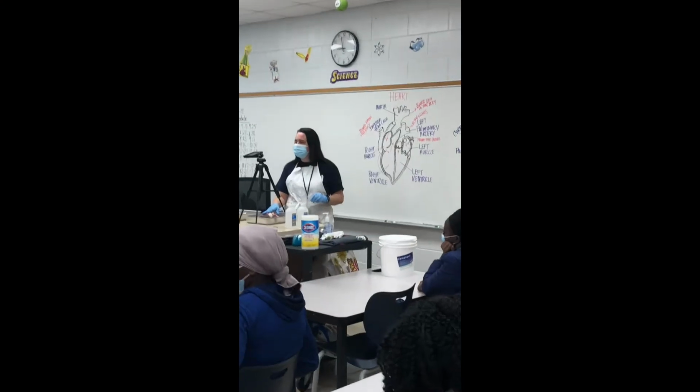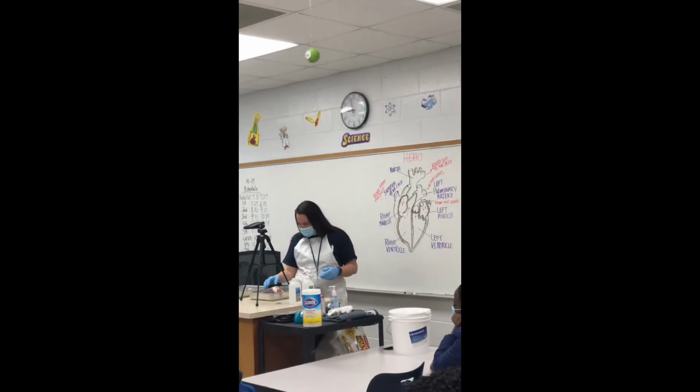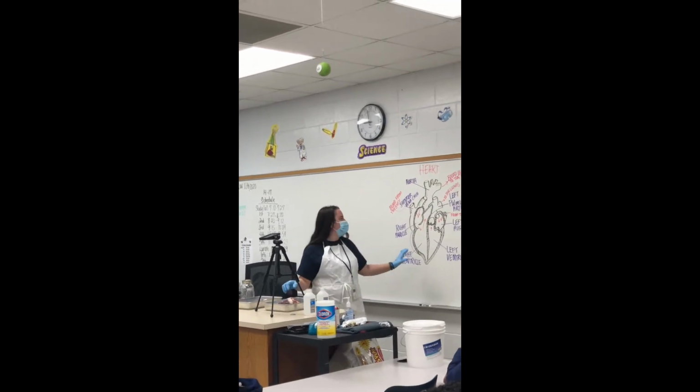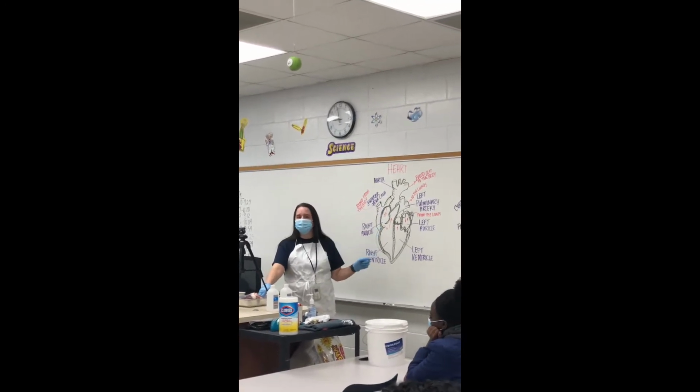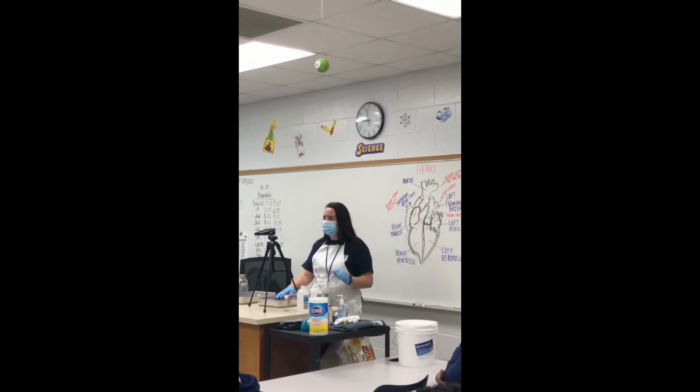So we look at the deer heart because the deer heart is very similar to the human heart, okay? So that's why we brought it in the past. I've got a diagram up here which shows all of the parts of the heart, and then you'll be able to see what I'm doing right here.